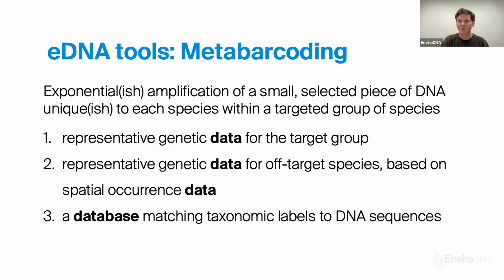So this is really one of the main benefits of genetic monitoring tools, in that we no longer need to rely on continual input of expert taxonomic advice. We just need it written down once in a database, hopefully correctly, for all to use. And this is certainly an ongoing process.